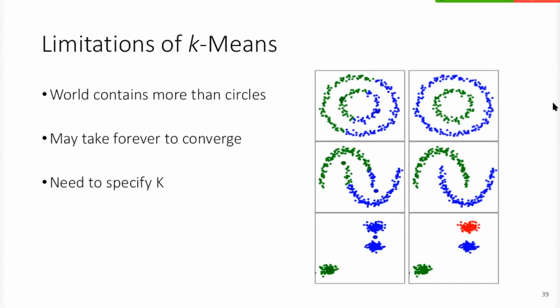You have to really keep in mind that k-means has a specific assumption about the shape of your data. So if you cluster data with k-means on the t-SNE or the UMAP space, keep in mind that if you have a round cluster, that's easy to define. If you have a long shape, then k-means cannot resolve that. And again, you need to specify k, but that's also the case for every other clustering method. It's just a very hard decision on what you want to get out of the data. Convergence is a bit of an issue, but you can forget about that for now.